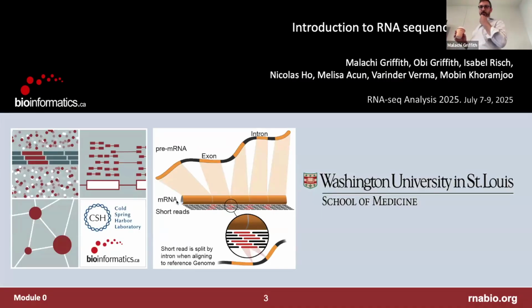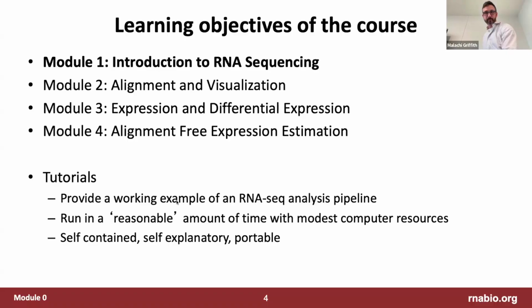Okay, so this is the Intro to RNA Sequencing lecture. Please do ask questions along the way. The goal of this lecture is, before we really jump into command line bioinformatics tools, R programming, and Unix programming, to think a little bit about how the data gets generated and how we need to keep those details in mind when interpreting the data as we work through the bioinformatics analysis and workflow. If you have questions or comments about where the data comes from, on the genomic side of things, this would be a good time to discuss those things.